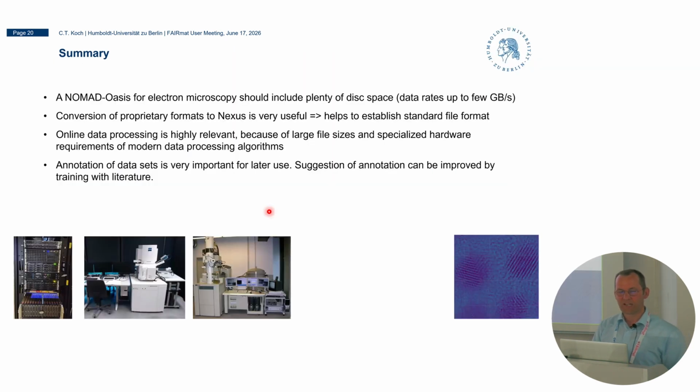This is my summary slide. In electron microscopy, we have a demand for a lot of large data sets, so we really need local storage. At least that's what we decided. We didn't outsource this because there's also a cost associated with that. Once you have a little bit of money to invest, at least was our decision, we invested it into this computational and storage hardware.